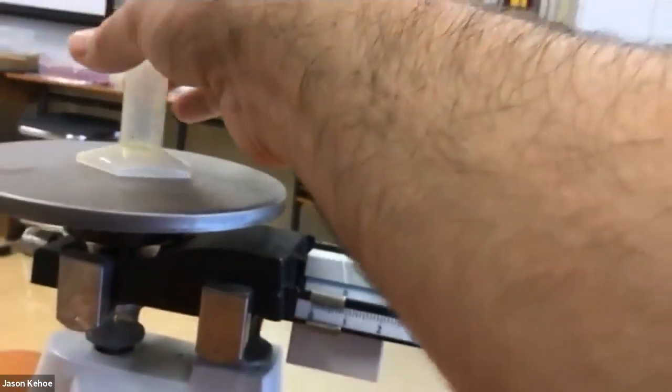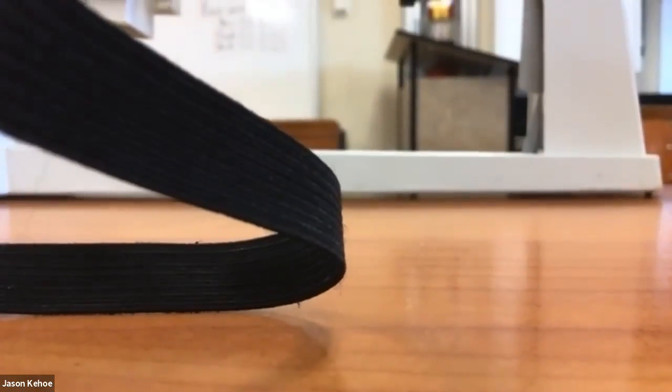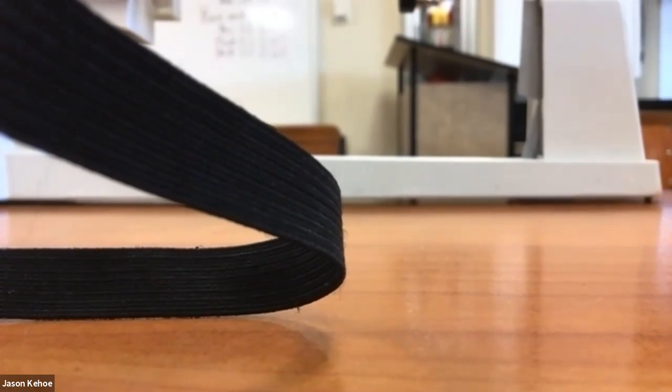All right, so I'm not going to walk through the process for each of these, but I will get it balanced and I will show you what it reads, and then you will have to just read the triple beam balance to find the mass.